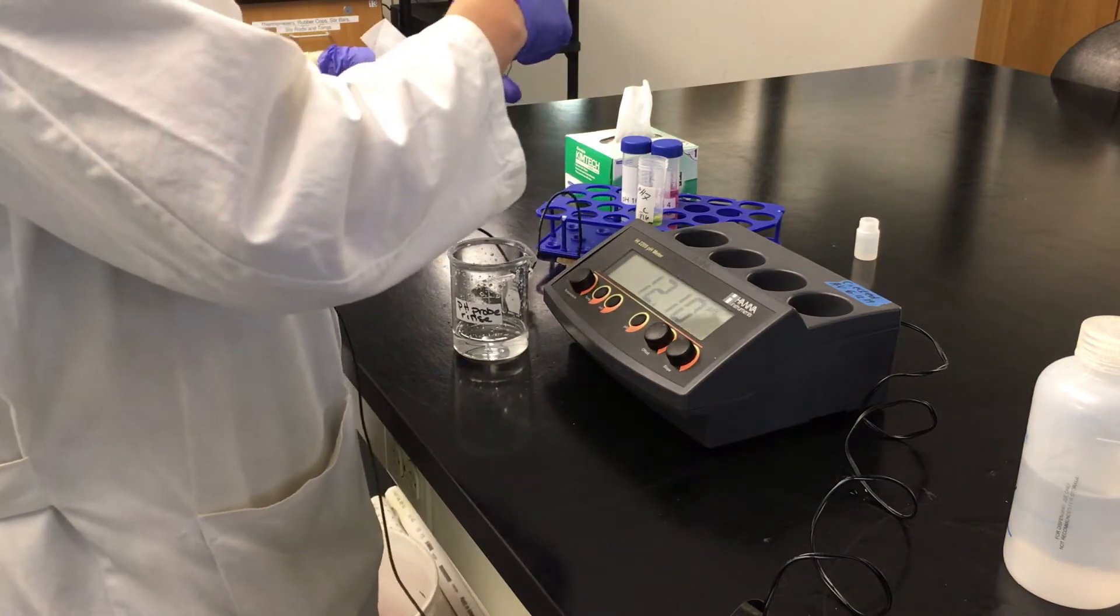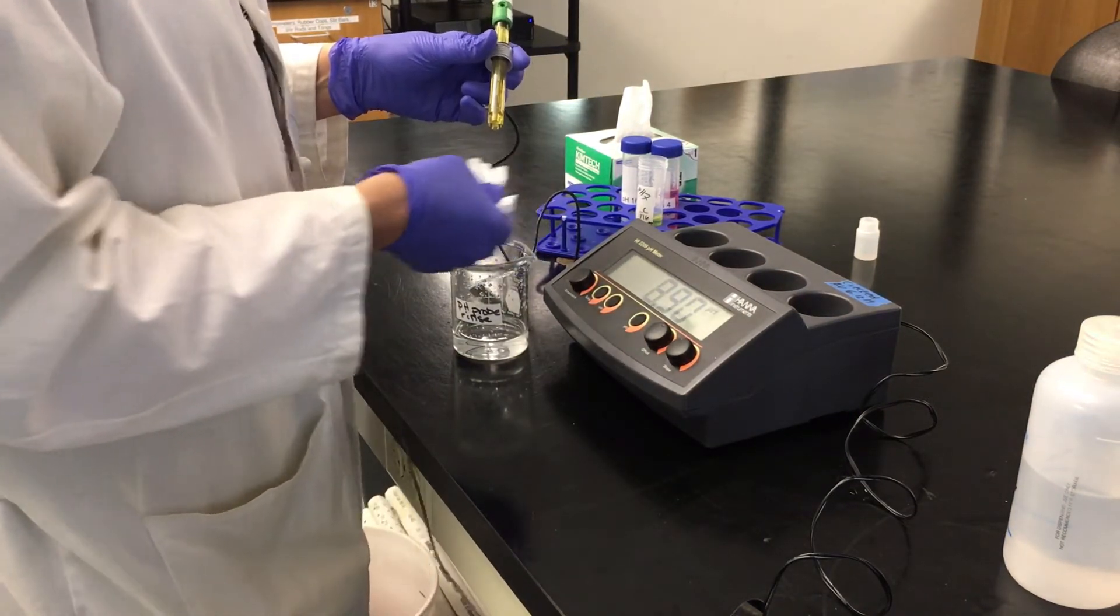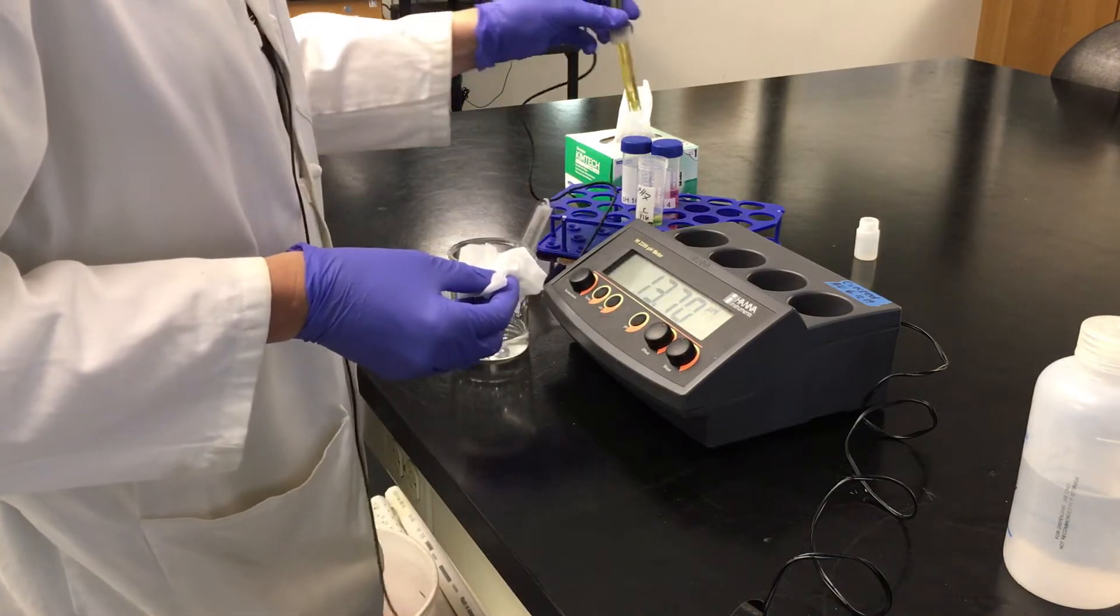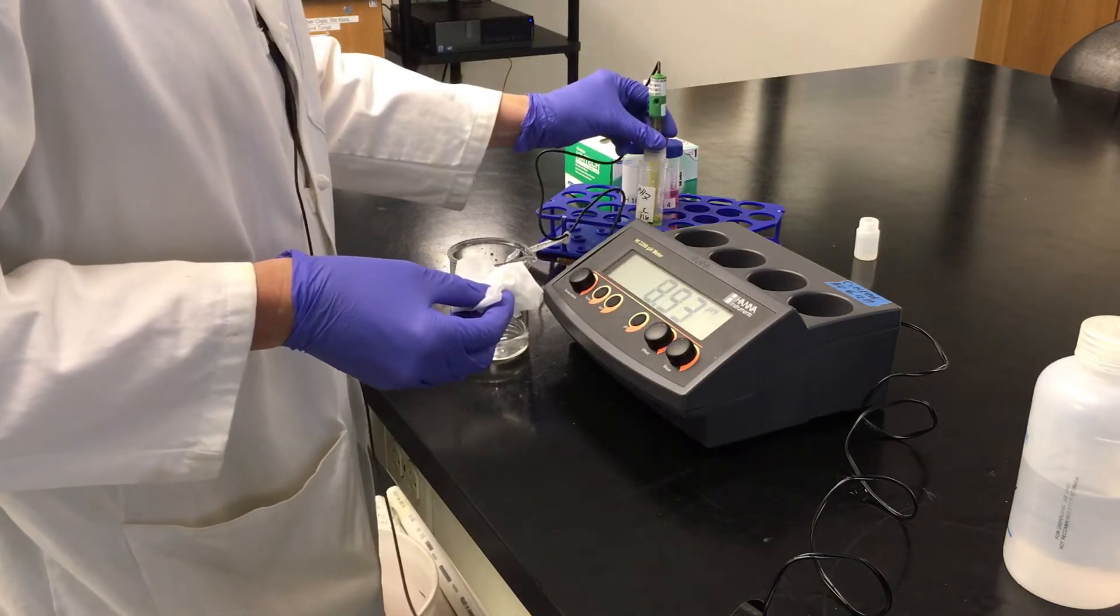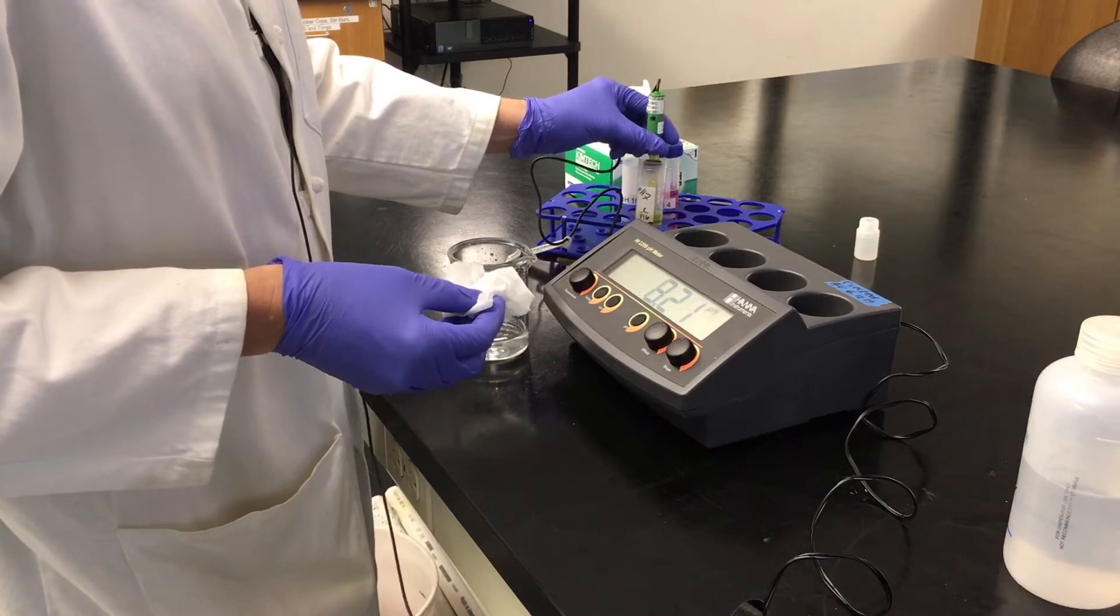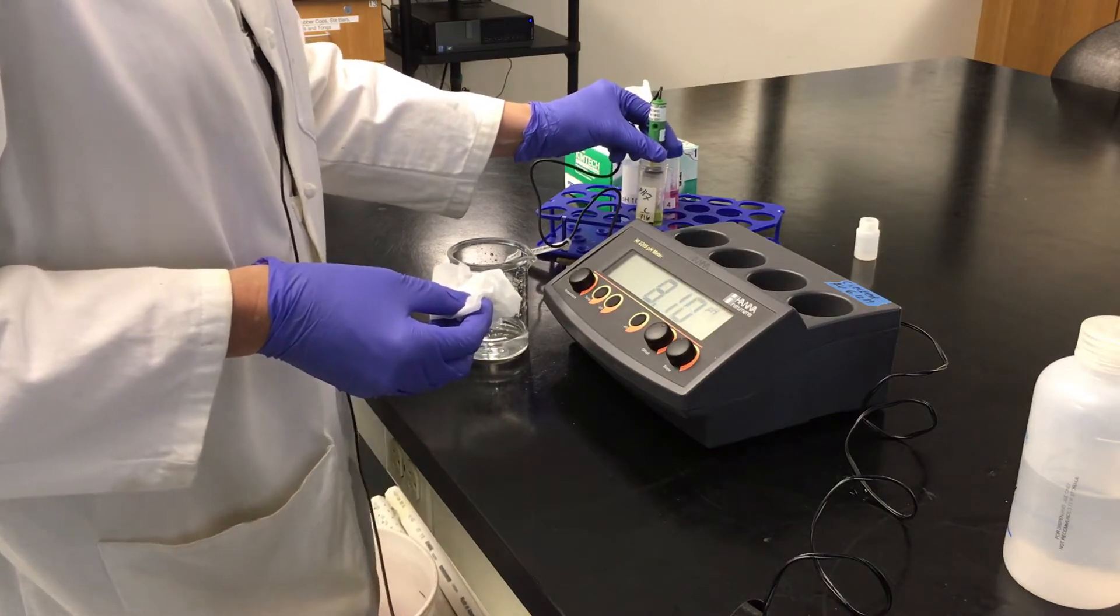We're not going to try to fully dry that bulb, it will damage it, so we're just going to dab it, and then place it, making sure that the junction is fully submerged into the pH 7.